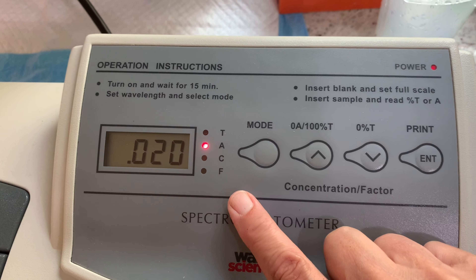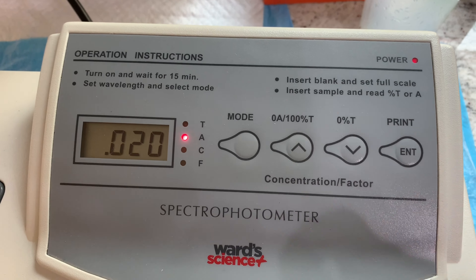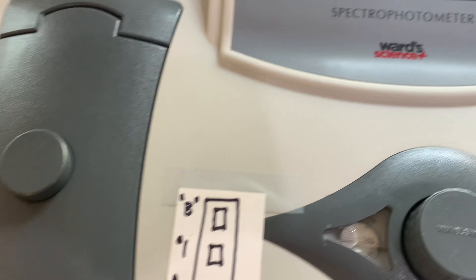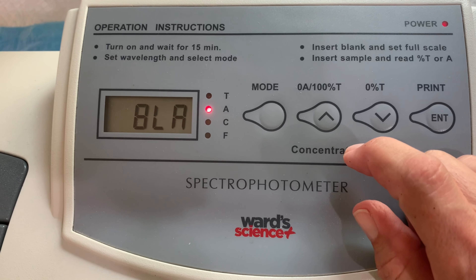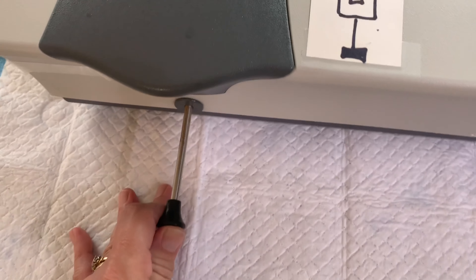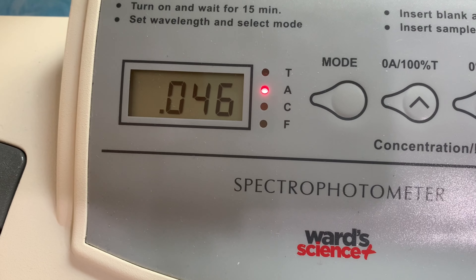The other button to know is the blank button. It sets the machine to zero percent absorbance or 100% transmittance. Make sure your sample holder is all the way out and the cuvette is in the blank position, then press this button. I always say: if it's not blinking, it's not blanking. Once it blinks, you're good — then all you have to do is push the holder in to get a reading without pressing anything else.